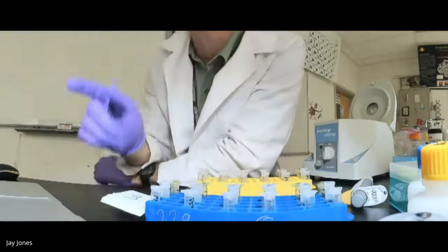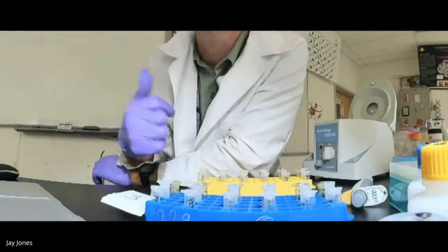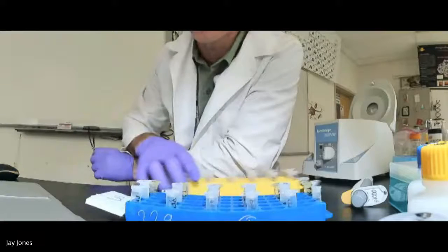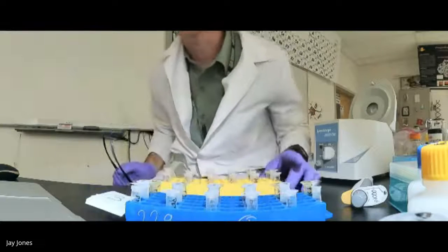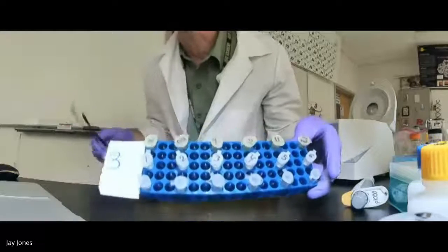This is the miniprep, miniature prep procedure for purification of plasmid DNA from recombinant E. coli. All right. I'm going to do two classes here.